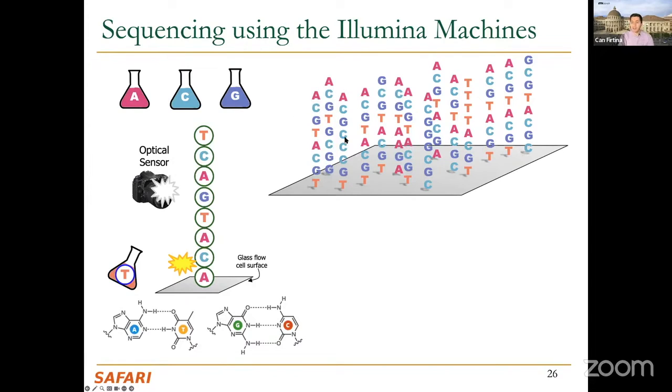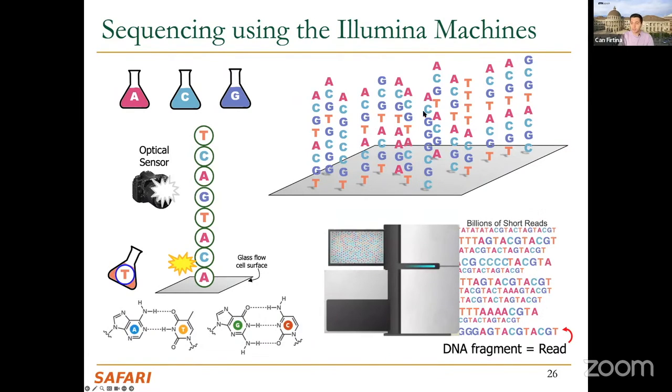So this is how SBS is working, and this is done at every cycle, base by base. But essentially, the problem is that we cannot do it for so many bases. We can only do it for around 400 to 500 bases, and this is basically what's limiting the read length in Illumina technologies. In theory, you could actually sequence reads with 1,000 or a few thousand bases.